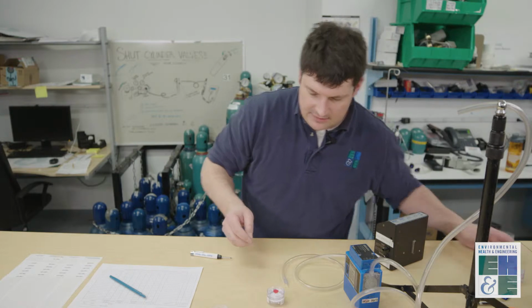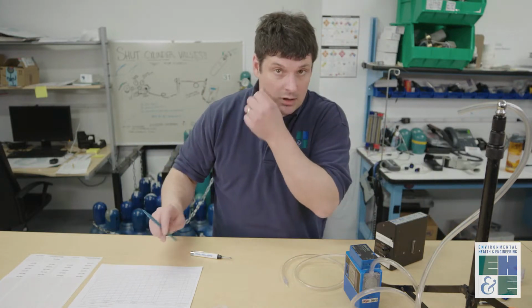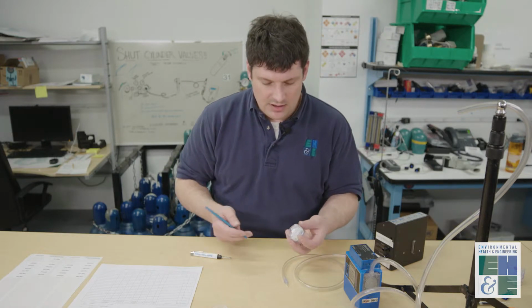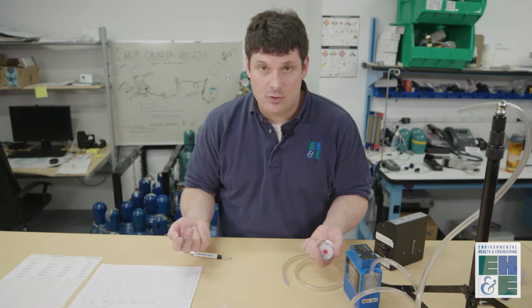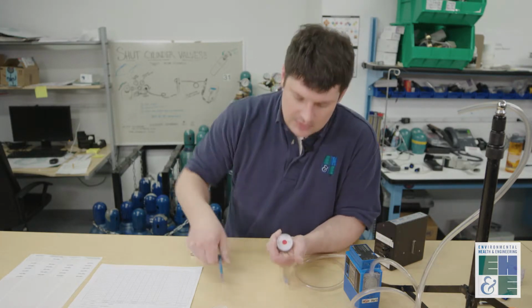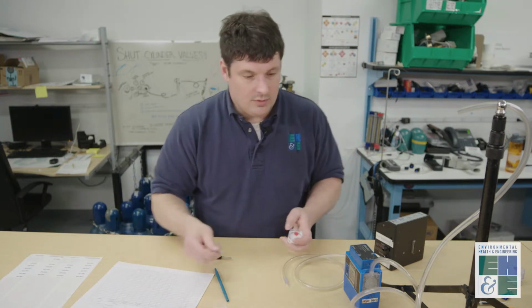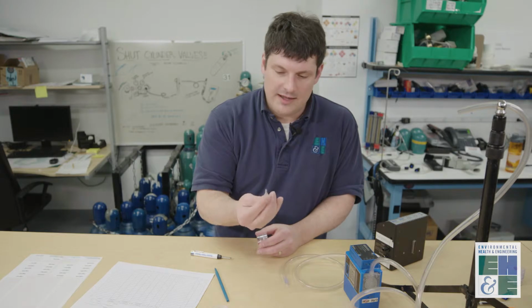So in this case, I'm going to use a dummy to set my flow rate for multiple pumps. I like to label my dummy so I don't accidentally use it as an actual sample. So I'll write dummy on it. To attach a filter to the pump, I need a luer adapter.